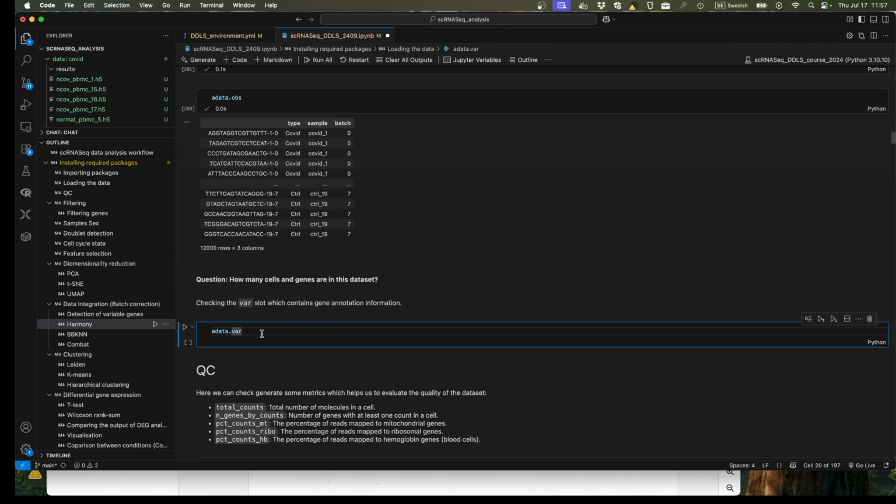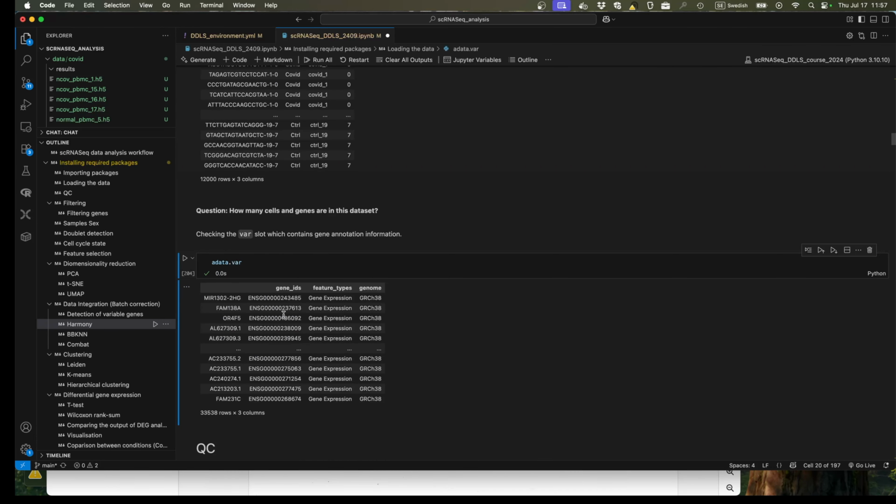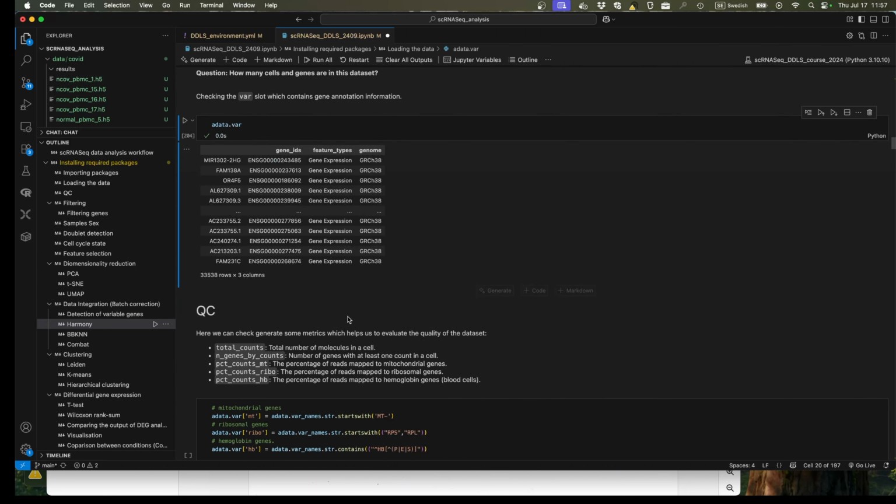Now let's check out, I cannot talk. Anyway, we can check the var as well. So what we have, again, we have the gene ID, feature, and genome, which we looked into.